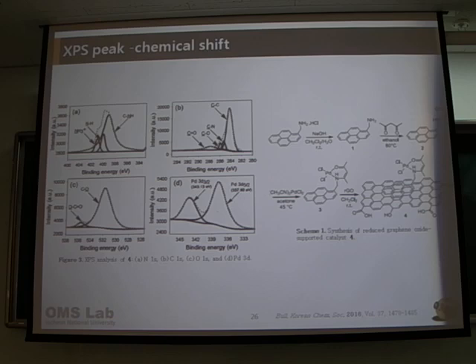Actually, there are several types of reference, because this is the pyrene moiety. Do you know this pyrene moiety can bind with graphene oxide through pi-pi interaction? There are several papers as evidence. No, that's not what I want to hear. If there is no coordination, you will have an imine peak, right? If there is no coordination, then it is impossible to get the number A. For example, this is N, and this one also C=N, and this palladium. Yeah, that's what I want to hear.